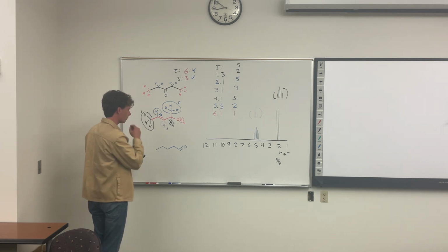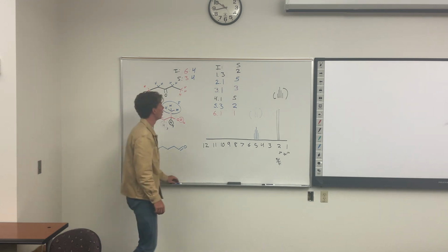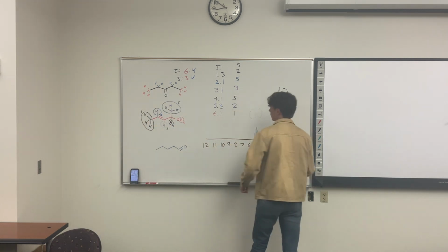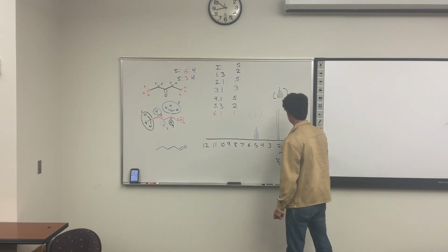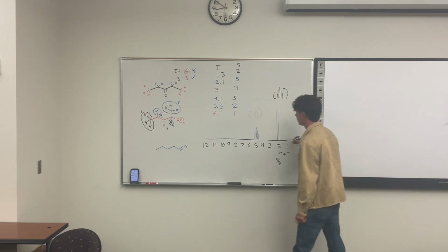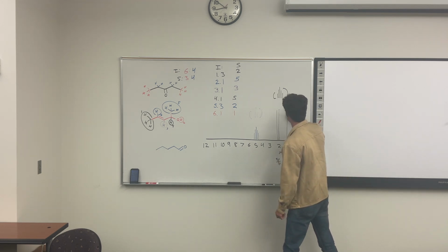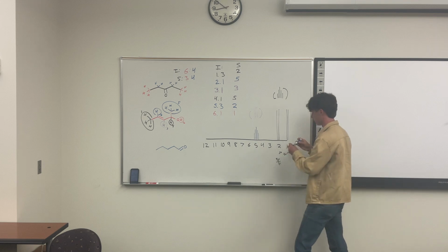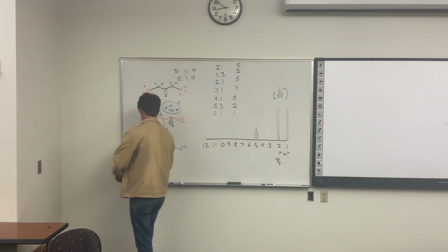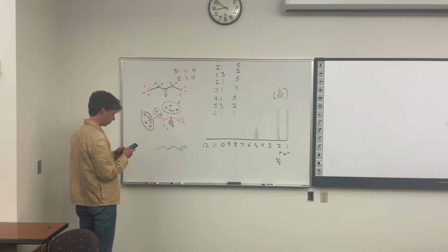Group 5 is just an alkyl group, intensity of 3, split into 2. And since it's just a regular primary alkane, it's going to be right around number 1, intensity of 3. I said this one was 3, so I'm going to make it as tall. Split into 2. There you go. And last group, our alcohol. Intensity of 1, not split.